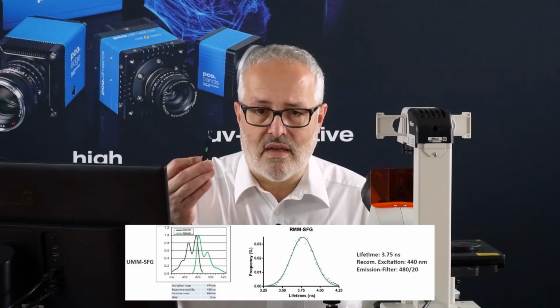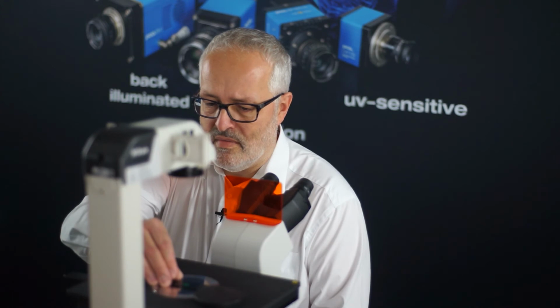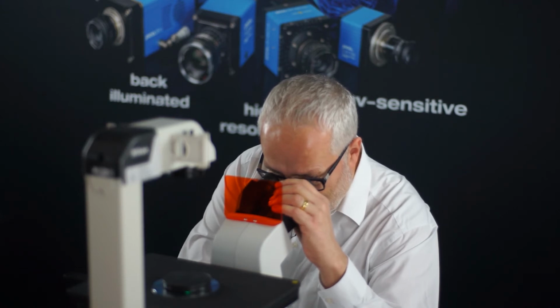With the adjusted camera controls, with all the settings that you need for your later on measurement, you make this measurement while placing the reference on the stage, switching on the light, covering it, and then focusing the microscope to the surface of that slide. And when you're ready with the focusing, you can switch to the camera and continue with the rest of the measurement within the software, which is in our case Nikon NIS Elements that controls the whole system.